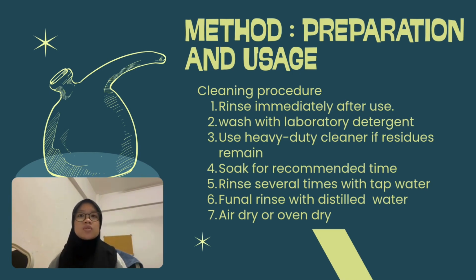After the cleaning, the glassware must be rinsed thoroughly with tap water, followed by distilled water to remove any remaining cleaning chemicals. Finally, the glassware is allowed to air dry or is put in the oven before use. Following these steps helps to maintain the quality of analytical results and also extends the lifespan of laboratory equipment.